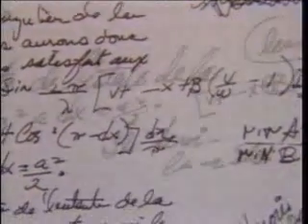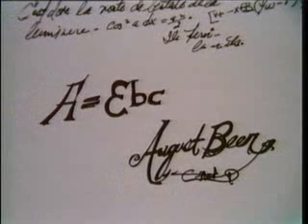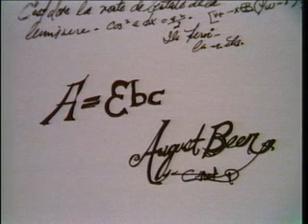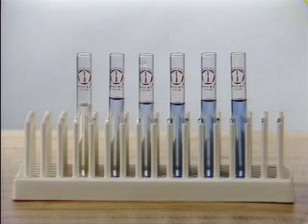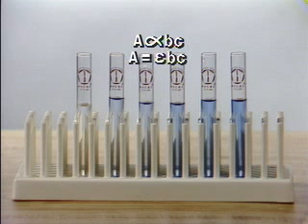Beer's law states that the absorbance, A, at a given wavelength is directly proportional to the cell length, b, and the concentration, c. If the concentration is measured in moles per liter and the cell length is in centimeters, then the proportionality constant is called the molar absorptivity and is represented by the Greek symbol epsilon. Beer's law is therefore commonly written as A equals epsilon b c.